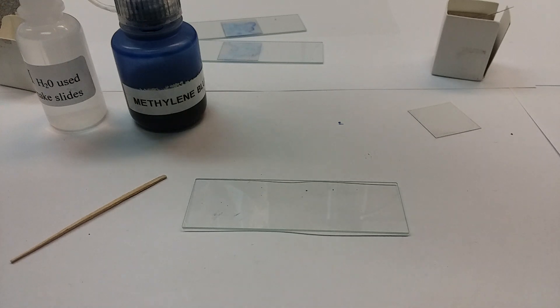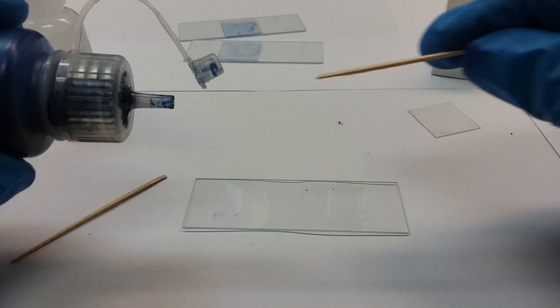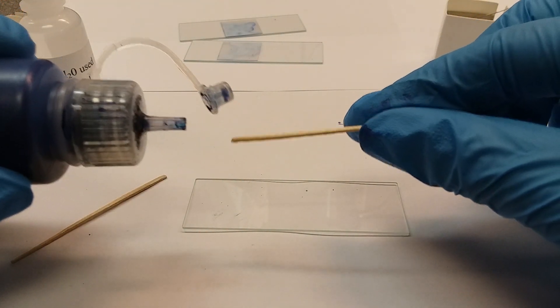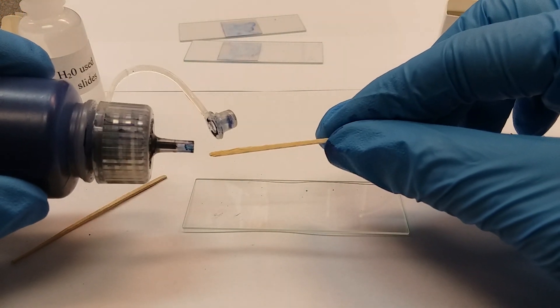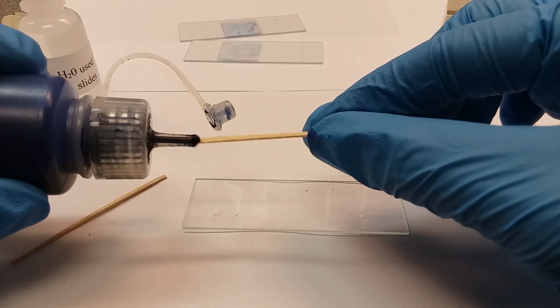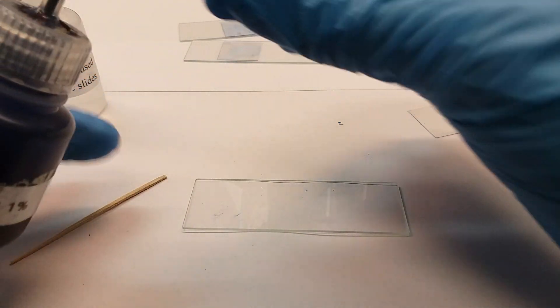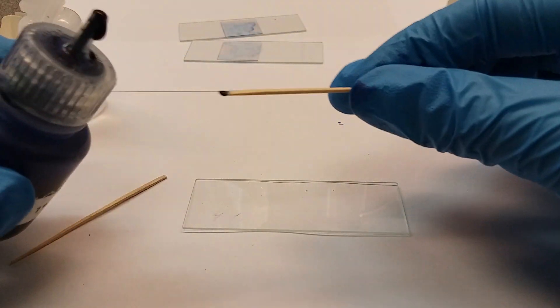There are two methods: you can either start using the water or the methylene blue. I use the methylene blue first. Instead of getting a whole droplet, because this stuff goes really fast and really far, I'm going to get a little bit. I'm not getting a full droplet because that's just way too much solution. I've got a good bit on here.